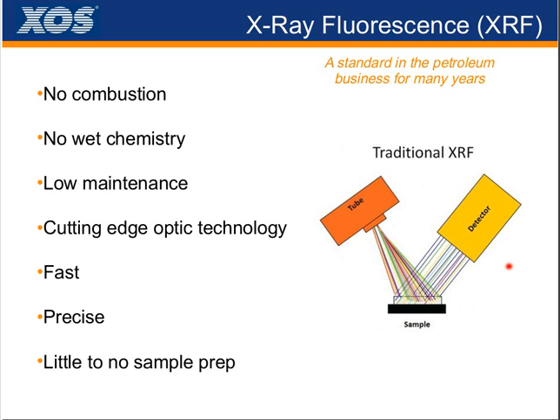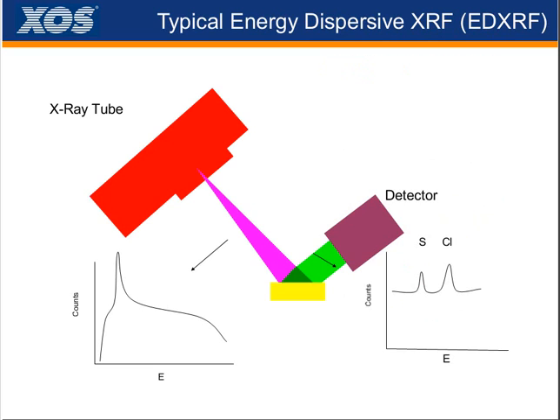So if you were to use this setup for a basic XRF instrument, you would be able to accomplish some level of measurement, and you would get some numbers, but when you're talking about sub-ppm or even below 50 ppm for light elements like chlorine and sulfur, it's just not readily achievable without some technological advance. Let's look at the next one here.